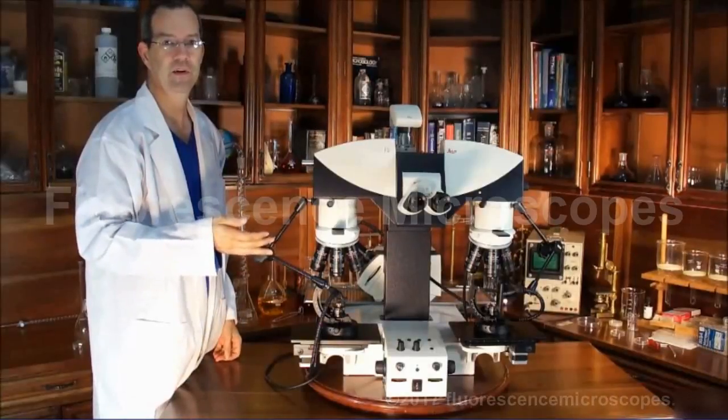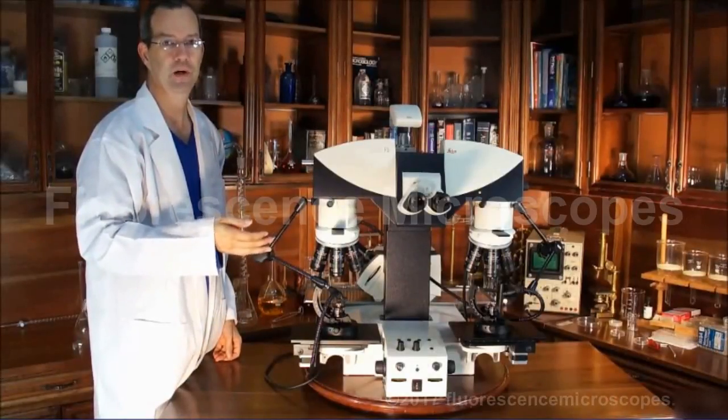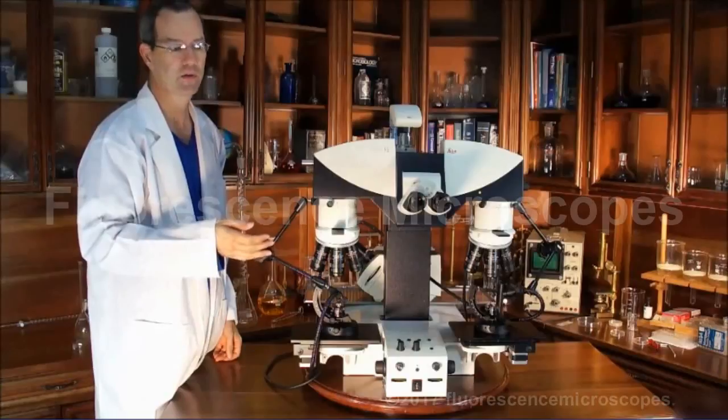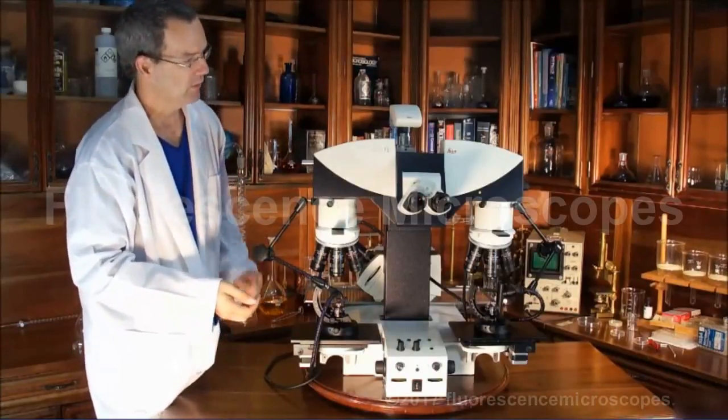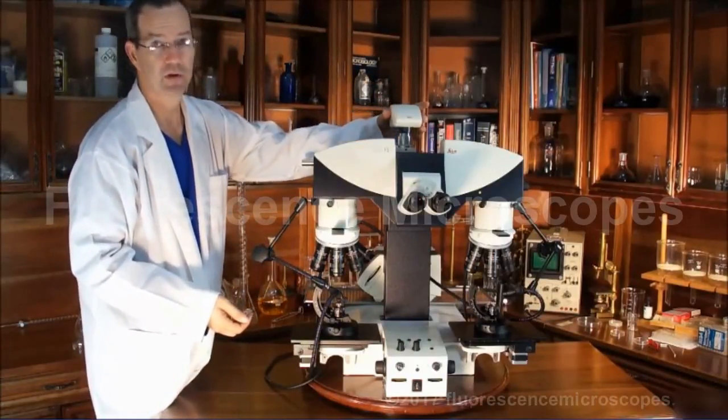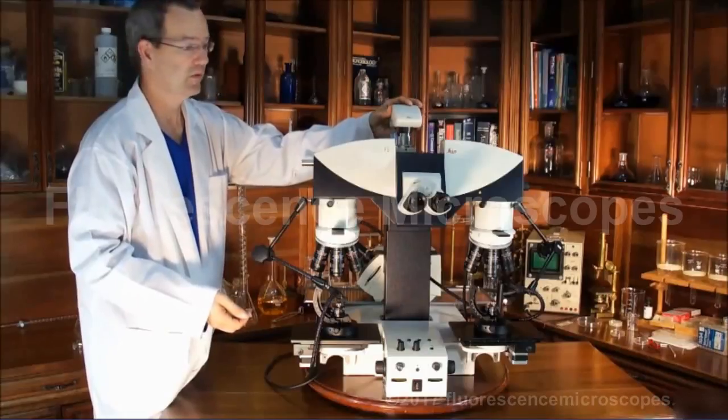This is a Leica FSC Bullet Comparison Forensic Microscope. We've got it configured with a camera on the top. We can put different cameras on this.